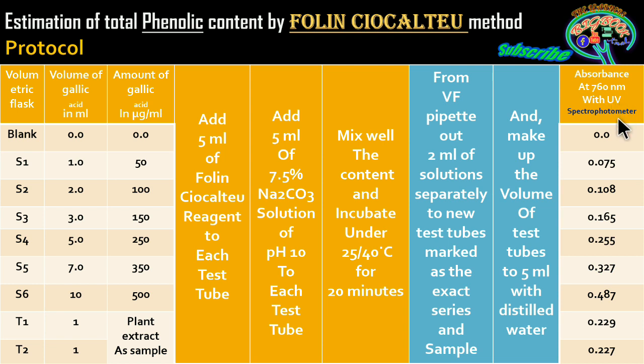Before measuring, we are going to keep all 9 cuvettes standing for 15 minutes so that the solution settles. After that, the absorbance will be a very exact measurement.